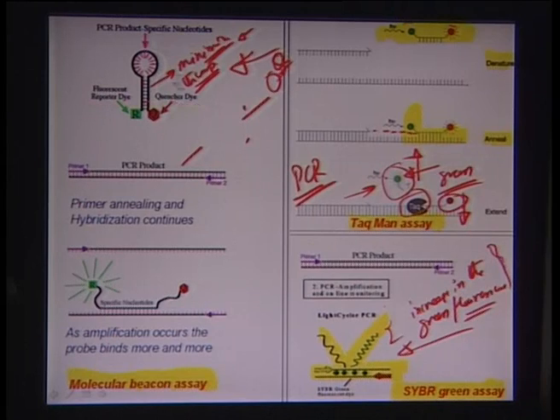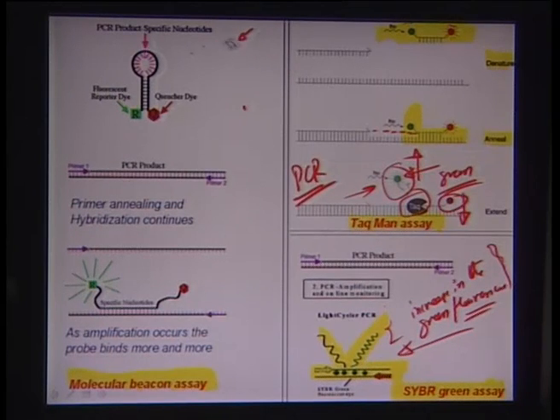Suppose we are looking into a denatured DNA, and we want to find out how this strand would bind. Let us say we have a denatured single stranded DNA in the proximity of a hairpin loop like structure with a reporter and a quencher, and we have these dangling sites or bonds.